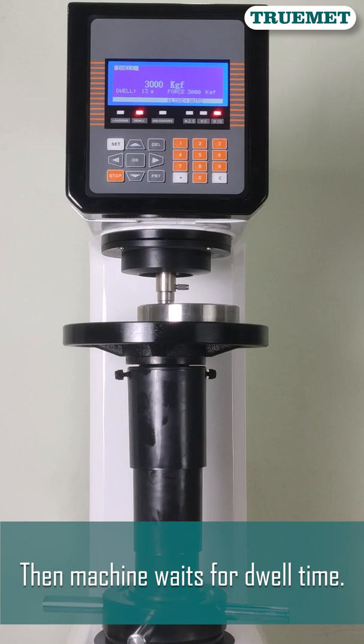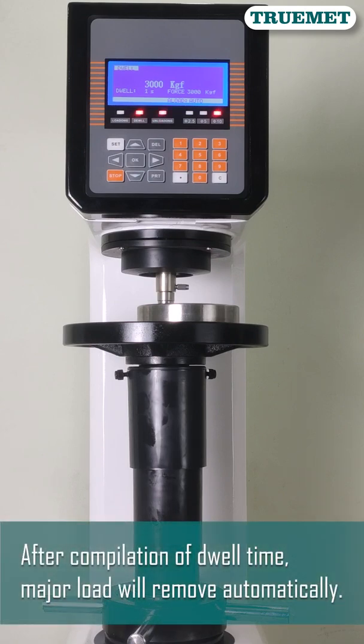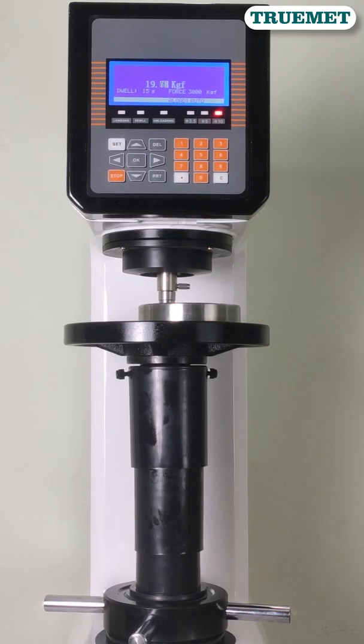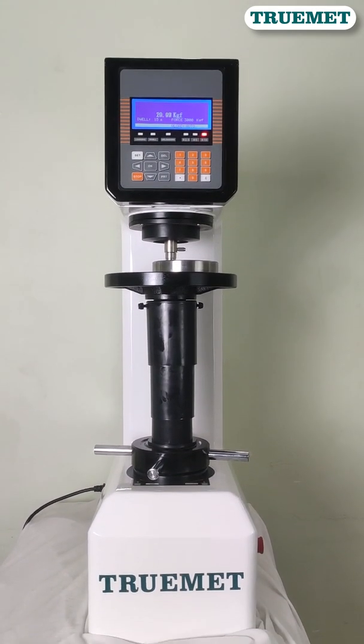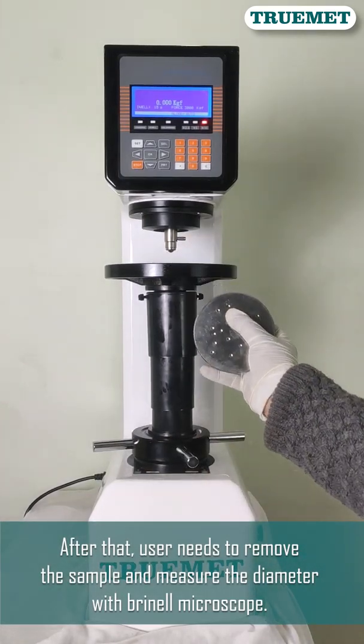The machine then waits for the dwell time. After completion of the dwell time, the major load will be removed automatically. After that, the user needs to remove the sample and measure the diameter with a Brinell microscope.